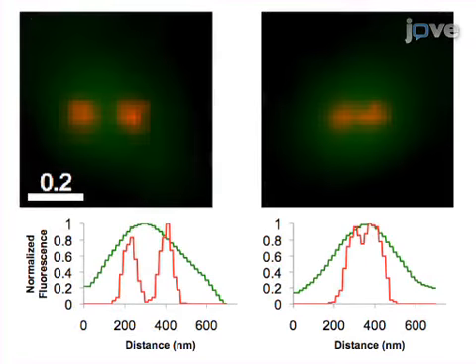Ultimately, line profiles of puncta intensity can be used to compare vesicle separation to vesicle width, thereby determining whether the vesicles are close enough to generate a cluster. Using this procedure, single-color photoactivated localization microscopy, or PALM, can be used to study the organization of organelles in most types of cultured cells.